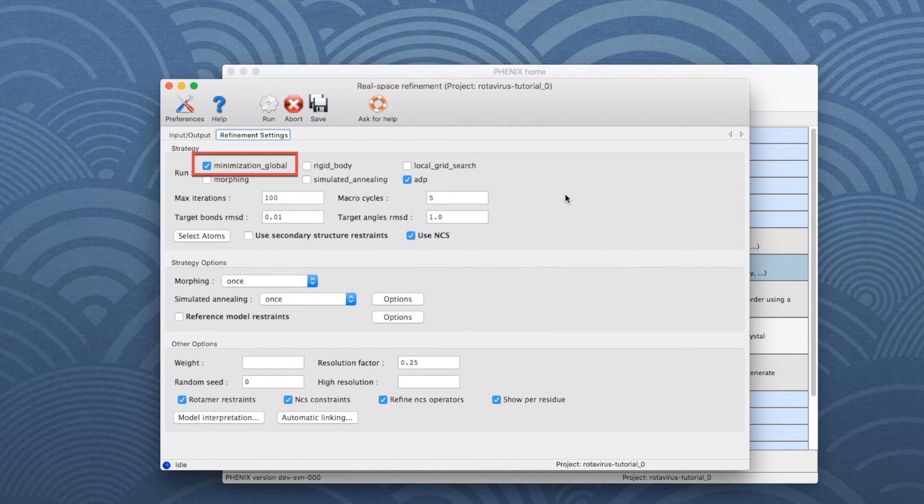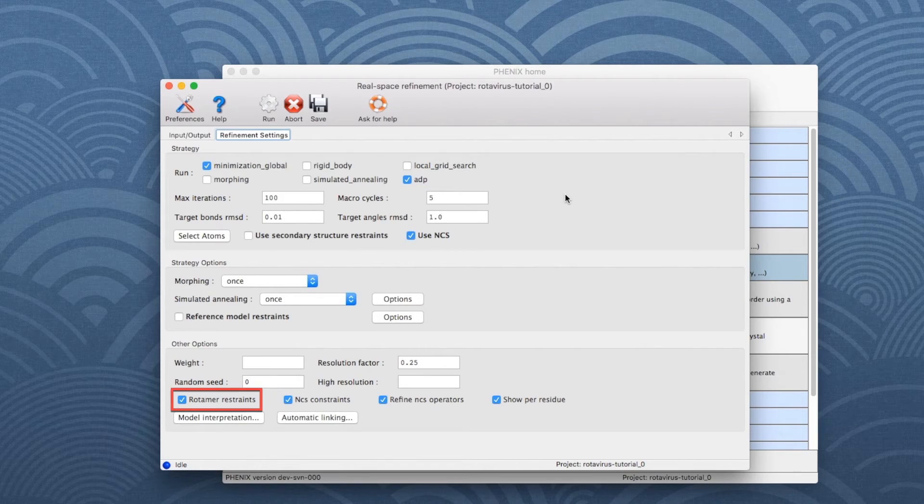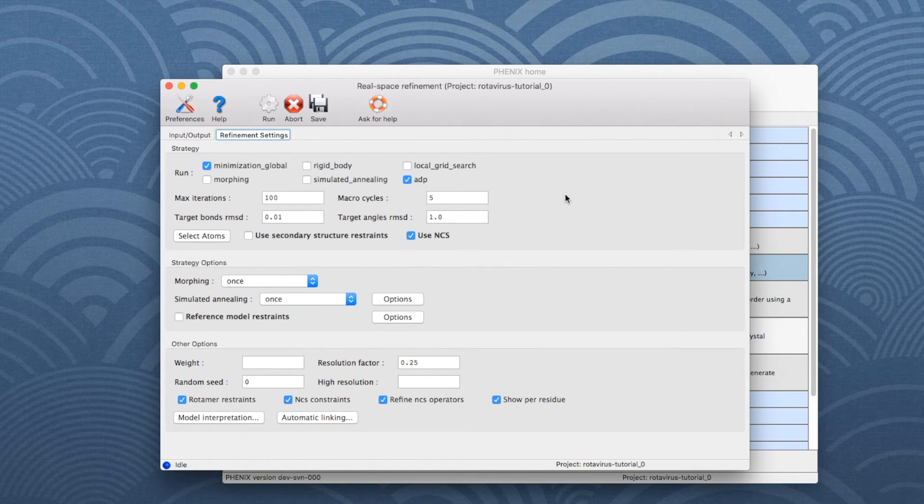Global RealSpace Refinement, ADPs, Rotamer Restraints, Ramachandran Restraints and C-beta Deviation Restraints.